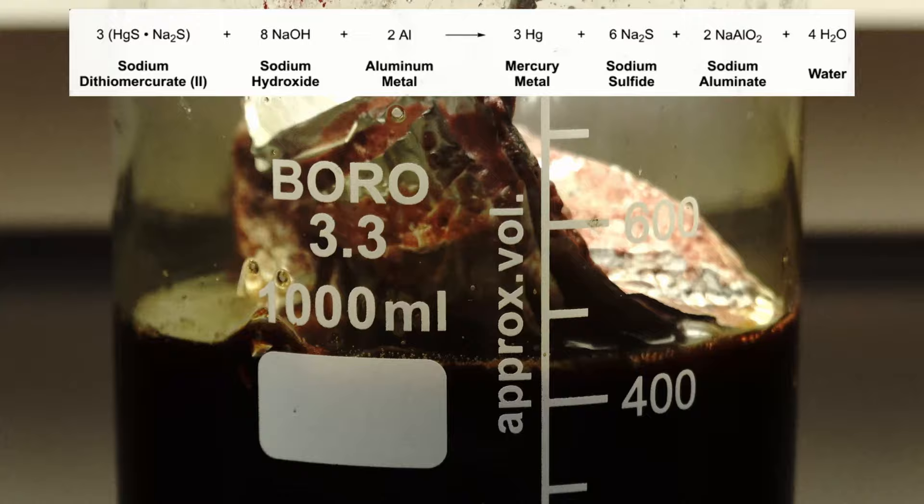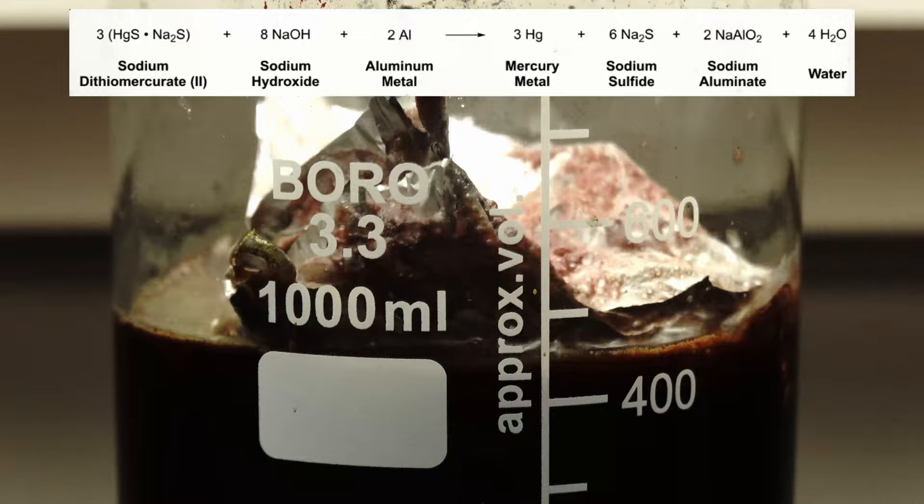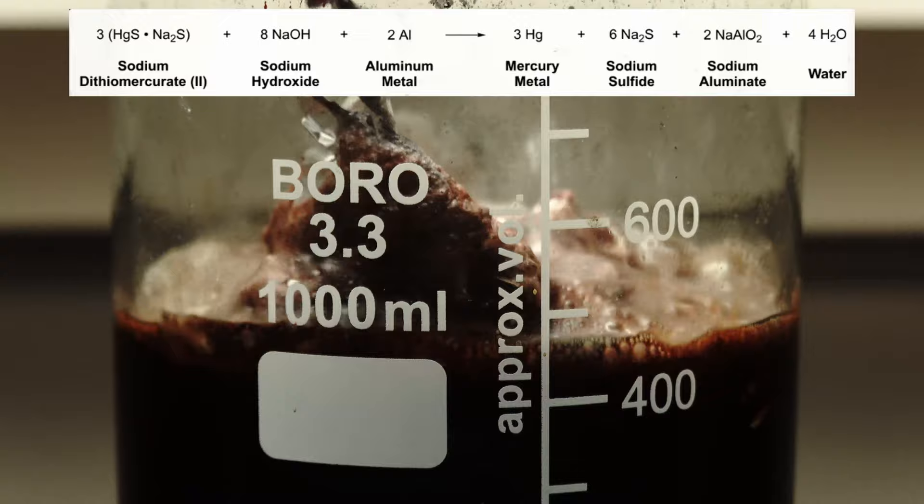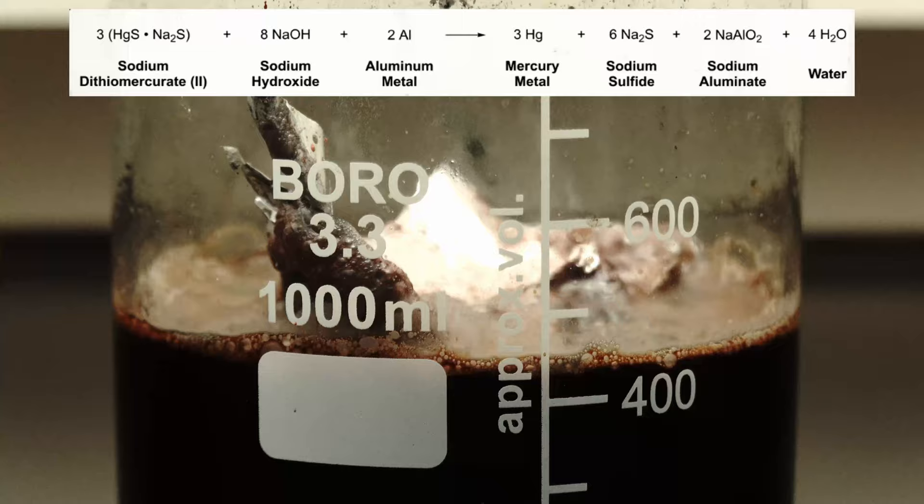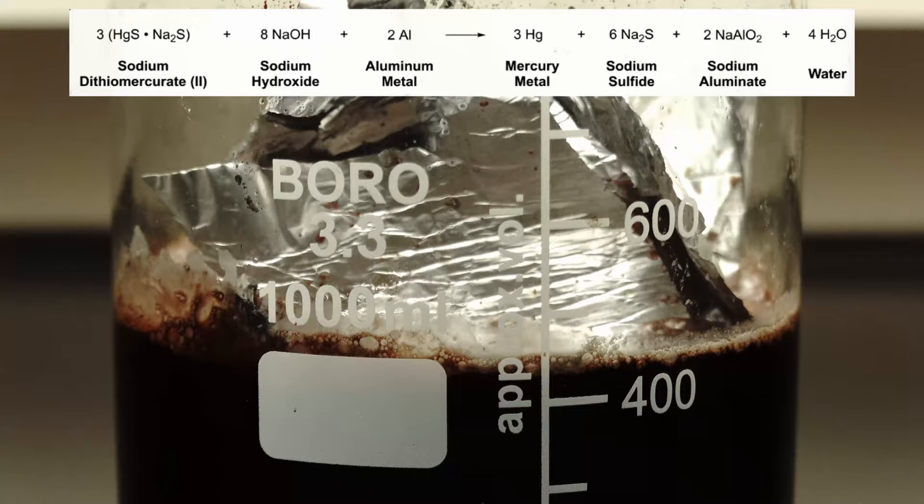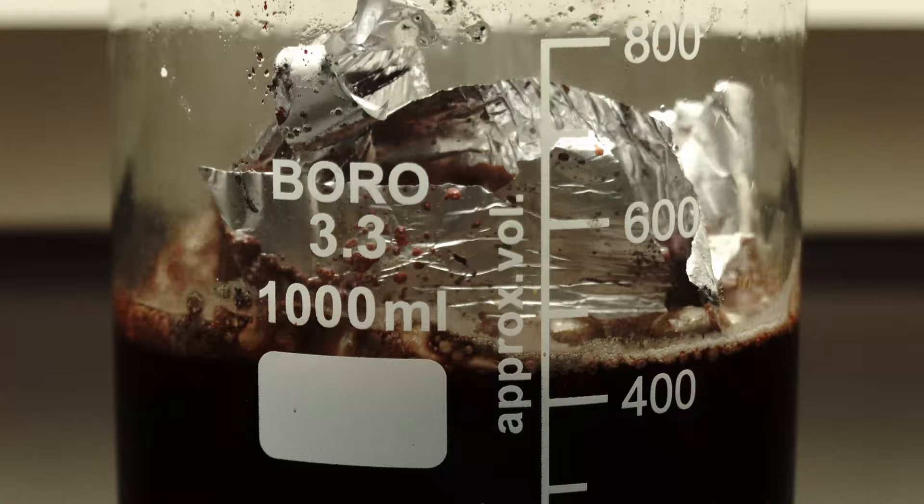What's happening here is that the aluminium is reacting with the dissolved sodium dithiomercurate, as well as the sodium hydroxide, forming mercury metal, some more sodium sulfide, sodium aluminate, and oxidane. The sodium sulfide proceeds to dissolve more mercury sulfide, which repeats the whole cycle over, in what's called a displacement reaction.